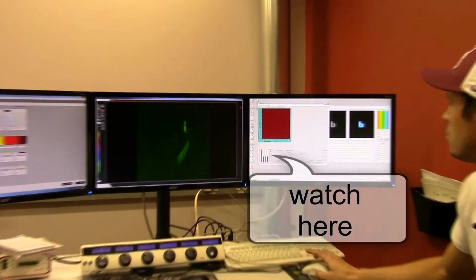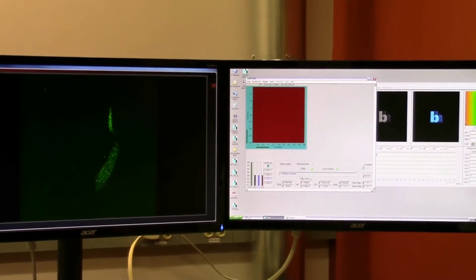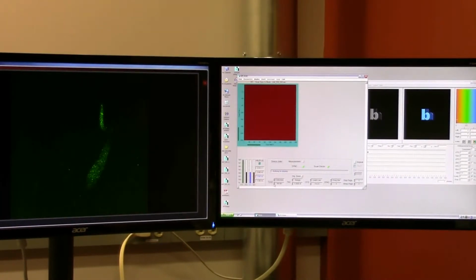So to collect enough photons, we need to collect over a period of time. For our uses, we're going to use 60 seconds, and you can adjust this down here at the bottom in the acquisition software to any number you like. If you have a really dim fluorophore, you would consider increasing the collection time, whereas with something very bright, you could probably do with a lot less.